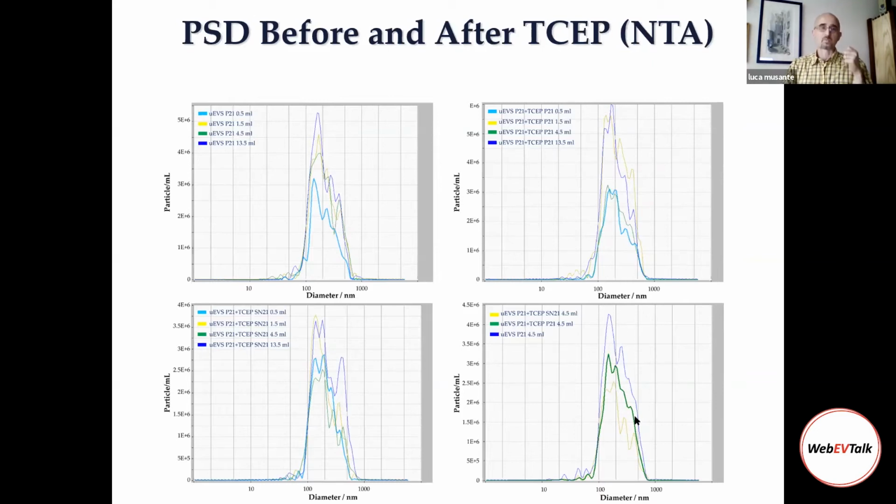So we know from the Western blot analysis that we retrieve the majority of the EV markers in the pellet. Some traces of TSG101 are left in the supernatant. Conversely, the majority of THP and albumin are in the supernatant. This suggests that soluble proteins, and this is already reported and known in the literature, like albumin, and in this case THP, in its different isoforms or aggregation and polymerization, can scatter light and mimic particles. So from the NTA point of view too, THP can be a confounding element along with albumin.